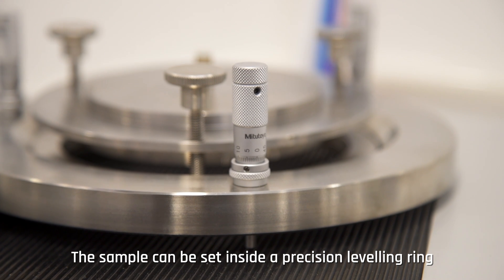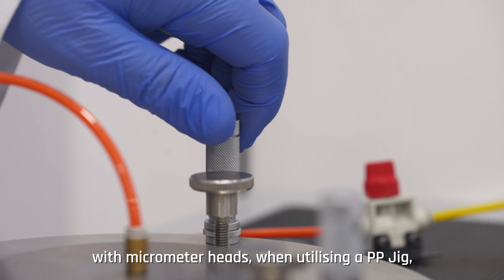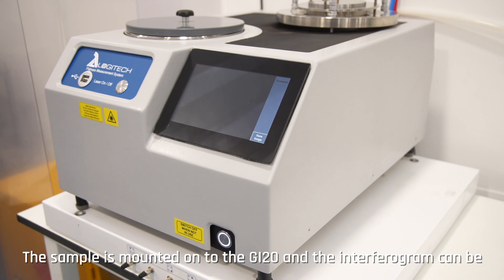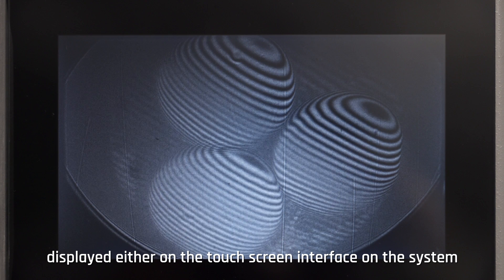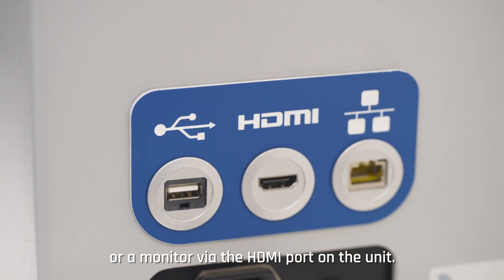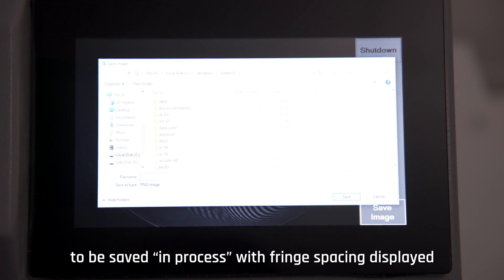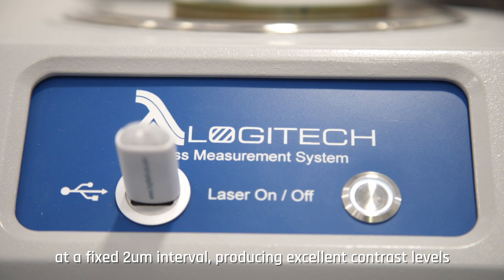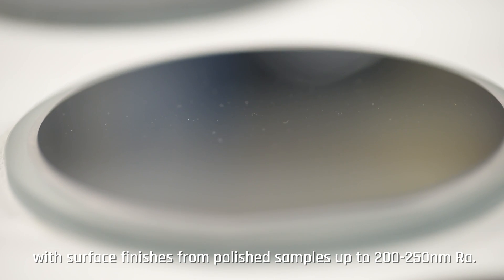The sample can be set inside a precision leveling ring with micrometer heads when utilizing a PP jig to allow adjustment to the angle. The sample is mounted onto the GI 20 and the interferogram can be displayed either on the touch screen interface on the system or a monitor via the HDMI port on the unit. The touch screen interface allows rapid and accurate measurements to be saved in process, with fringe spacing displayed at a fixed 2 micrometer interval, producing excellent contrast levels with surface finishes from polished samples up to 200 to 250 Ra.